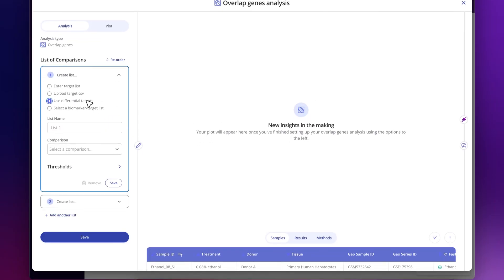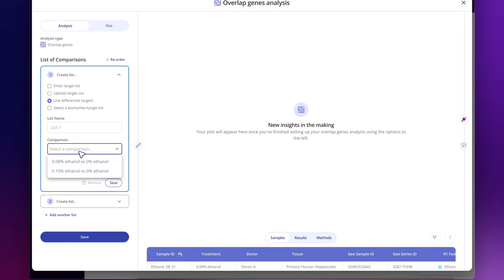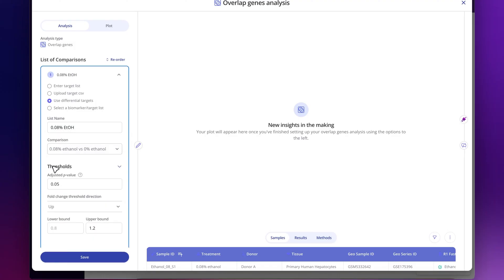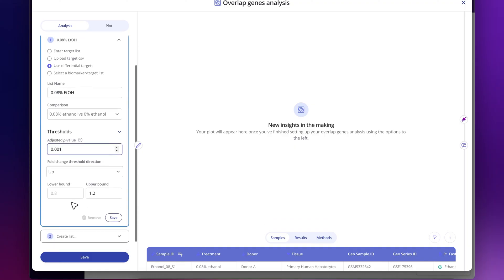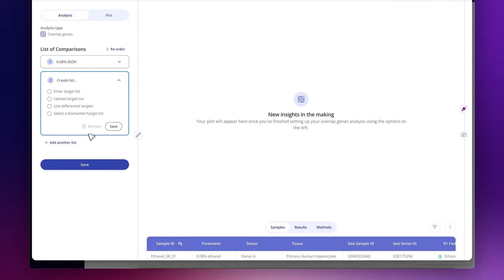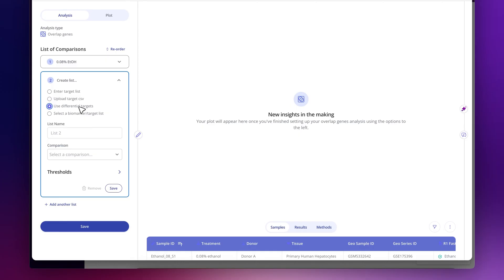I'll select my 0.8% comparison, call this 0.8%, select some relevant thresholds, and do the same thing for our 0.16.